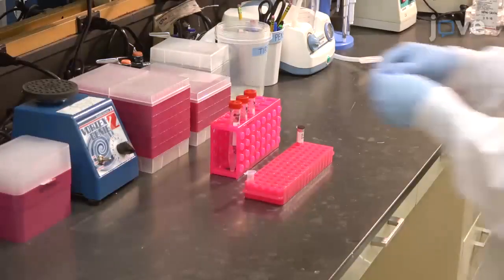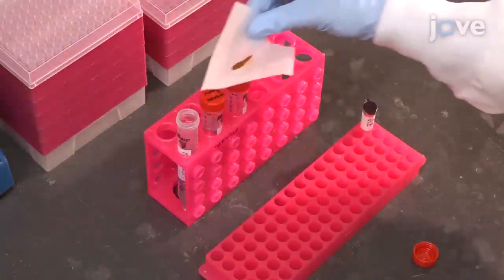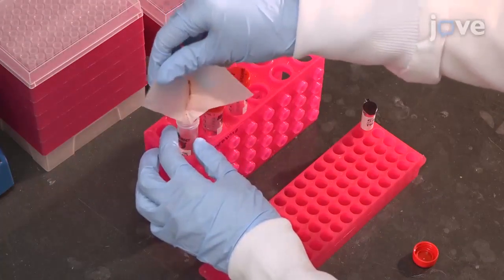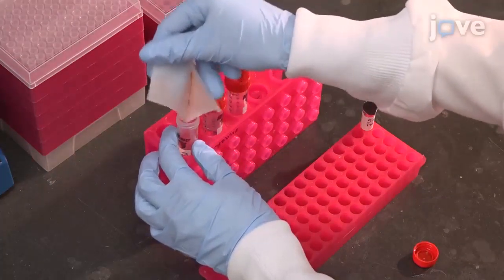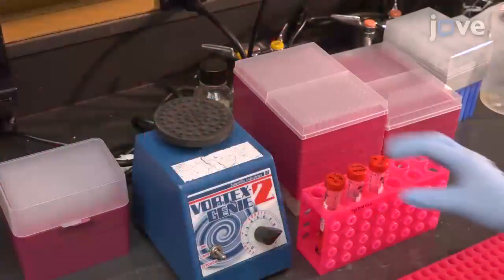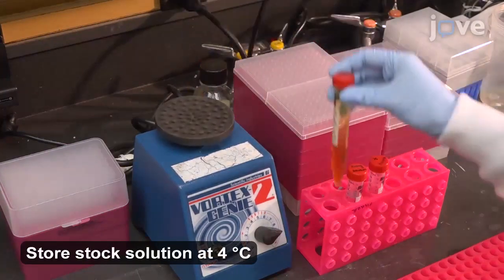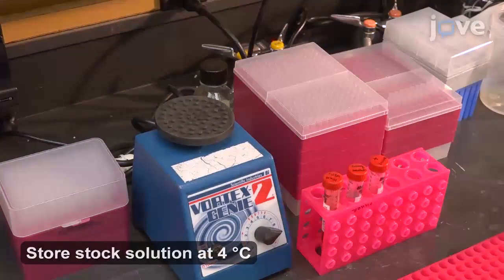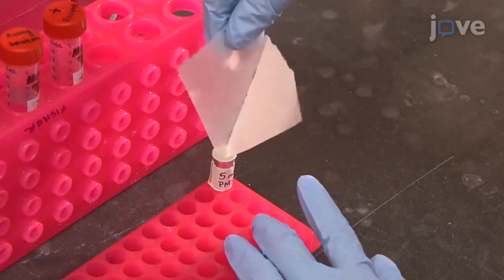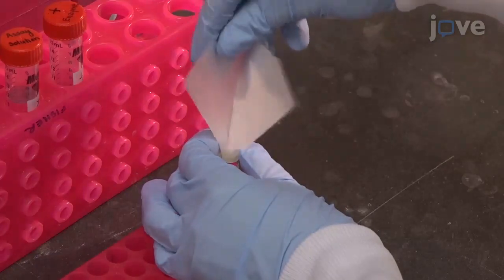Next, prepare stock WST1 and PMS solutions. Make a 10 millimolar stock solution of WST1 by dissolving 0.033 grams of WST1 in 5 milliliters of PBS. Then, vortex the solution. Then, prepare the stock solution of PMS by dissolving 0.0023 grams of PMS in 1.5 milliliters of deionized water.